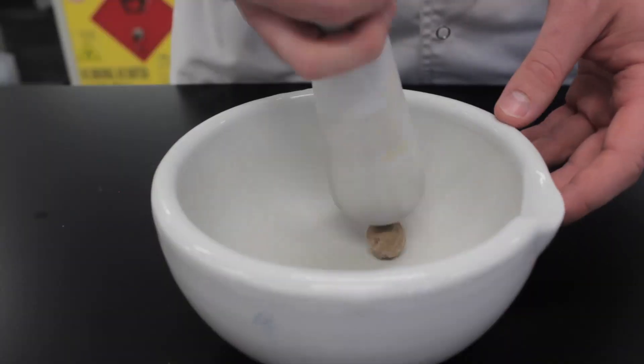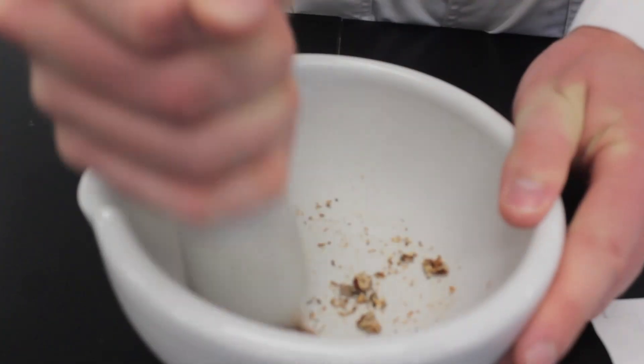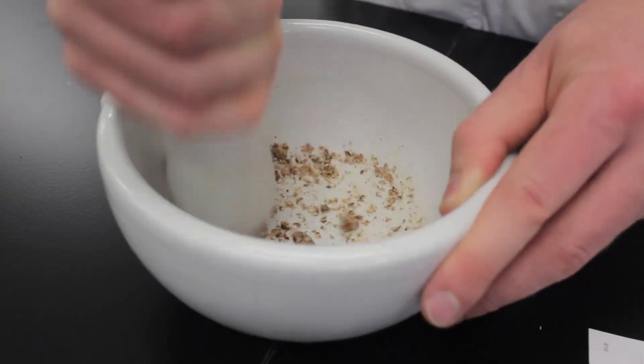Transfer this to a mortar and pestle. Try not to hammer the pestle onto the seeds but instead twist and grind to get fine particles.